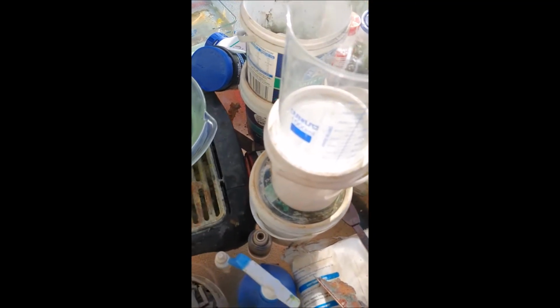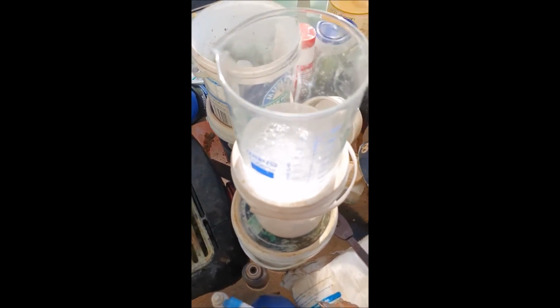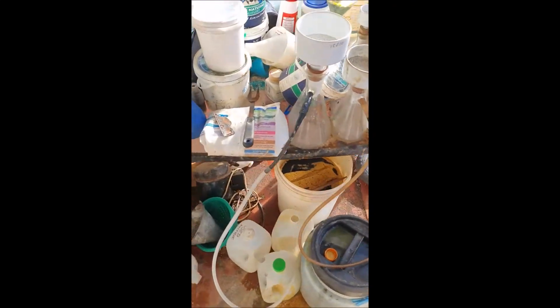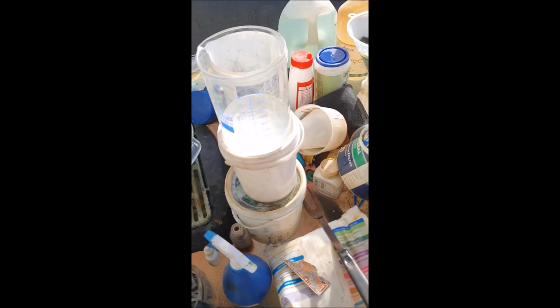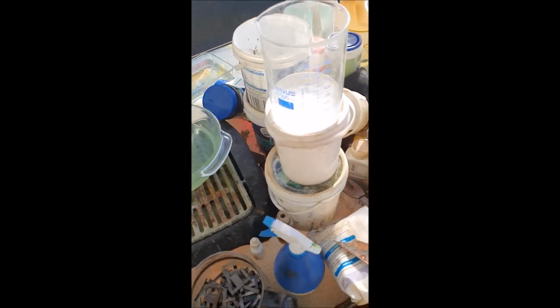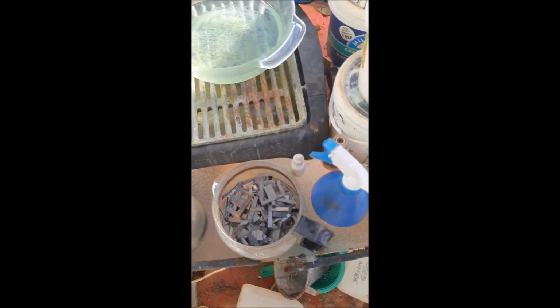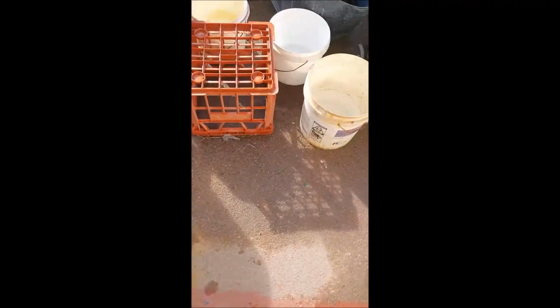So what we want is 250 mils of water. You can upscale this if you want to, or downscale it. This is just a rough guide, but you want 10% sulfuric acid. So if I put 250 mils of water, I want 25 mils of acid. So I'll put this in the pot. In fact, going by that, I'm going to need a lot more. I'll do another 250 mils.